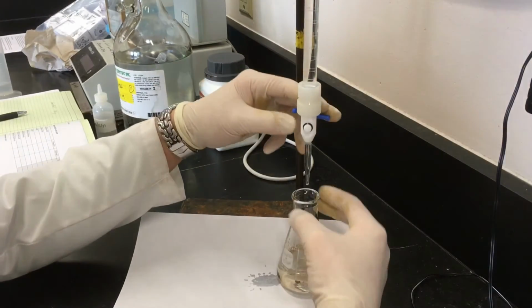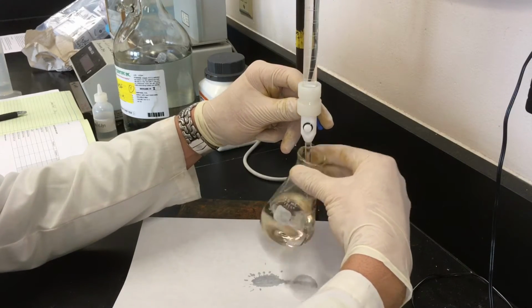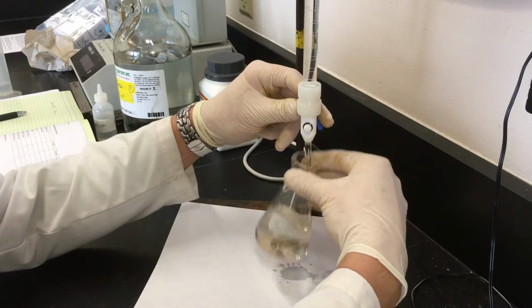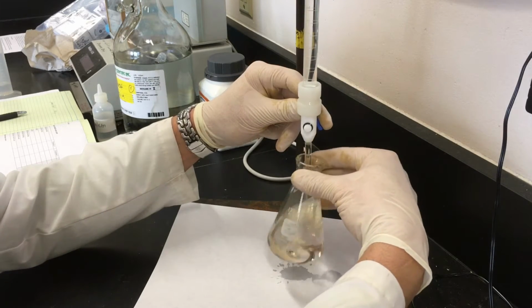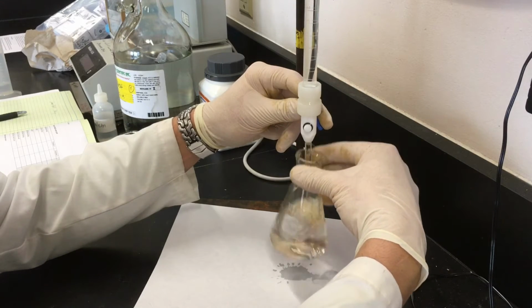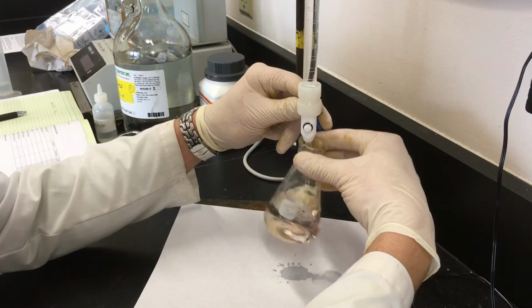So as we titrate, we swirl the flask continuously. It helps to have a white piece of paper underneath as a white background. We're not being too careful with the NaOH at this point, because it's really not changing color. Now it's starting, we see some pink appearing.